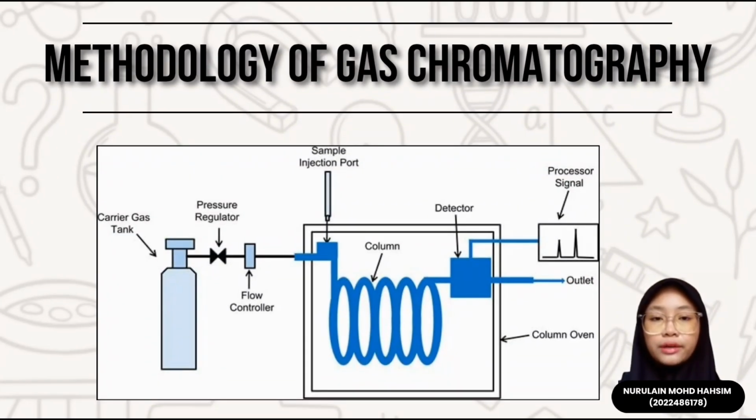My name is Ain. I will explore the principle and practical execution of gas chromatography, a powerful analytical technique used for separating and identifying chemical components within a mixture.